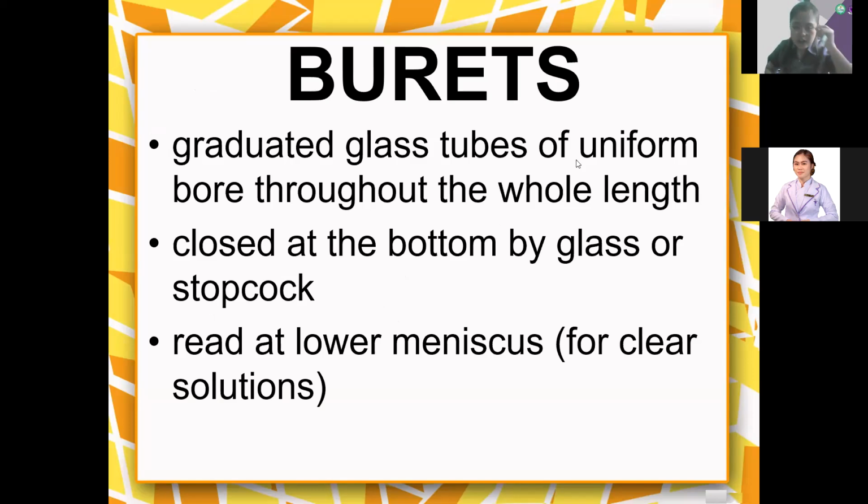Okay, now the burette. I believe you are familiar also sa nawong aning burette, no? It's a graduated glass tube. It's a long tube with graduation. And then at the bottom, you will see a stopcock.